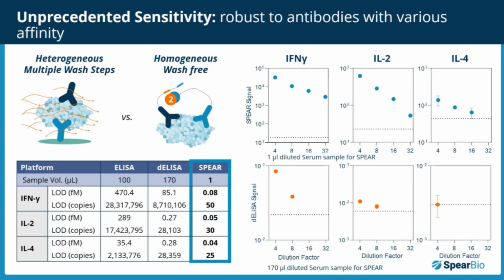To demonstrate this, we developed 3 low-abundance cytokine assays across 3 different platforms using the same pair of antibodies.